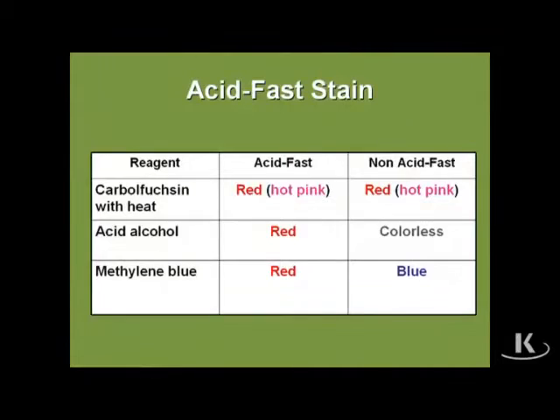And again, what you need to know, not necessarily is how to do one, what are all the steps, you need to know what the colors mean. So if I tell you, you had a patient coming in that was coughing up blood-tinged sputum, they had a fever, weight loss, night sweats. We did an acid-fast stain of the sputum and we saw pink rods. What does that mean? So instead of just coming out and saying we found acid-fast rods, they might tell you they found pink rods. And you'll have to know that means that's acid-fast positive, all right?